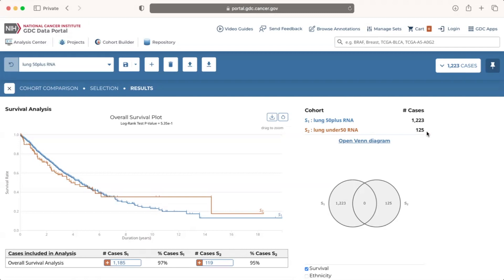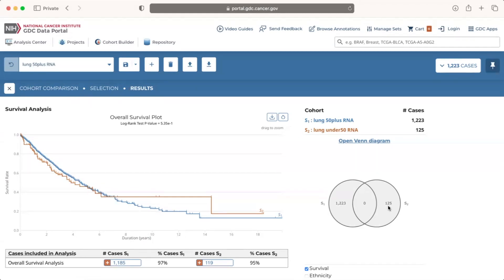Below the key is a Venn diagram which presents the number of cases in cohort 1 in the circle on the left, the number of cases in cohort 2 in the circle on the right, and, if any, the number of cases in both cohorts in the overlapping section. In this example, there are 1,223 cases in cohort 1, 125 cases in cohort 2, and no cases that appear in both.